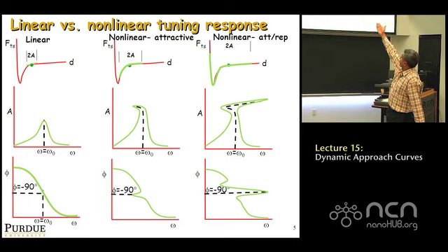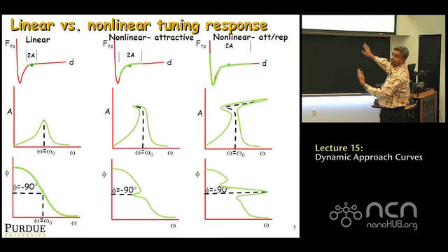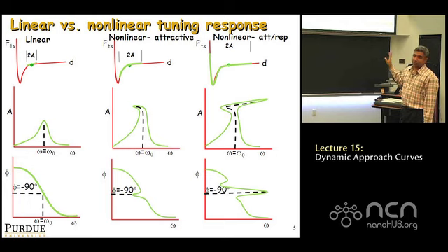By the way, in air, on normal surfaces like mica and such, this F versus D curve pretty much lasts for 2 or 3 or 4 nanometers. That's it. So we're talking already about oscillation. This would happen even if your oscillation amplitudes were 1 or 2 nanometers. It would happen, okay? Which is, again, much smaller than most people ever deal with in AFM. So my point is, it's always there, especially when you do this in air. You have to be careful about this.